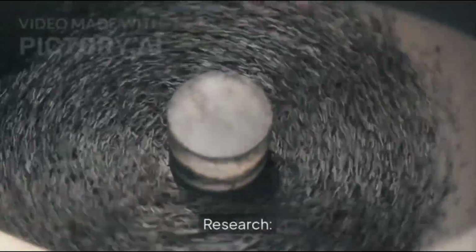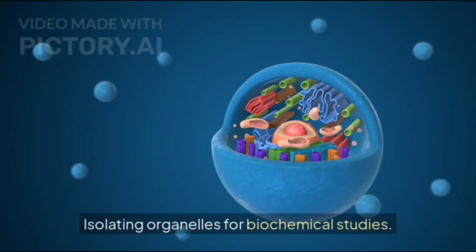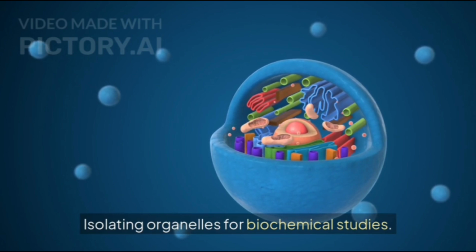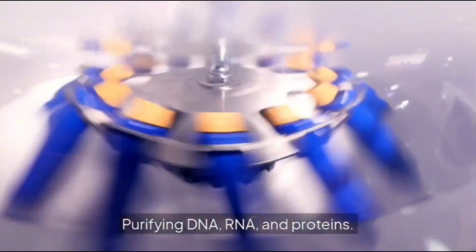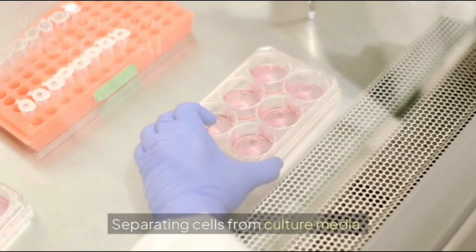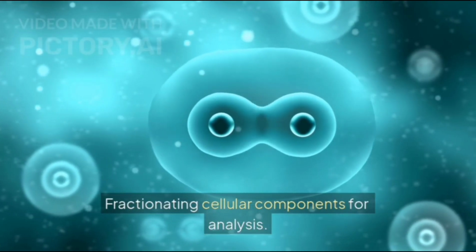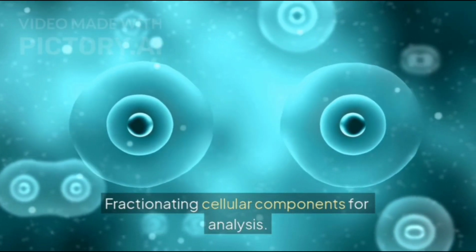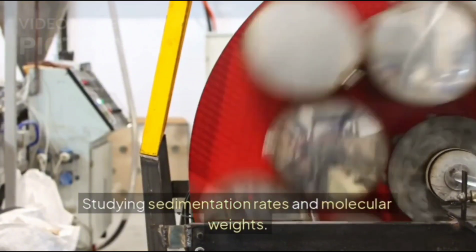Research. Isolating organelles for biochemical studies. Purifying DNA, RNA, and proteins. Separating cells from culture media. Fractionating cellular components for analysis. Studying sedimentation rates and molecular weights.